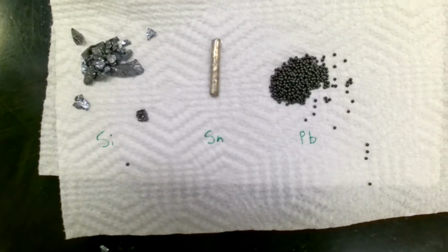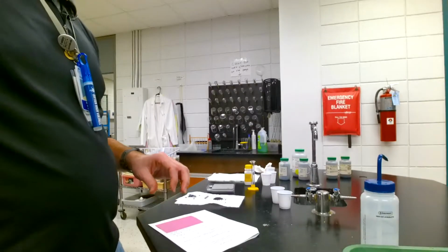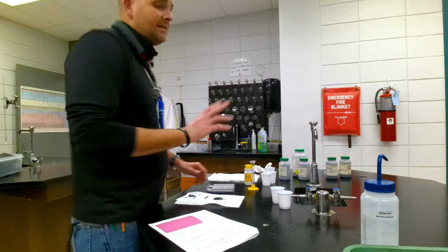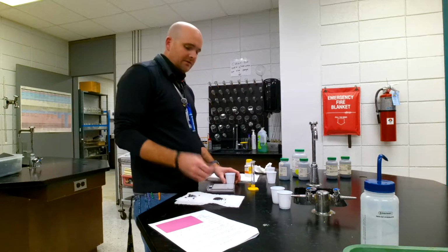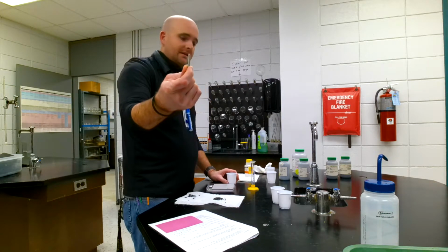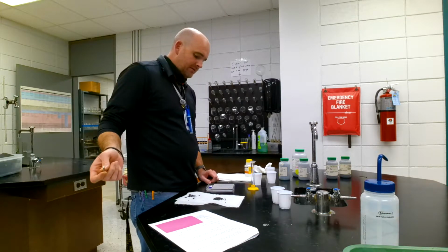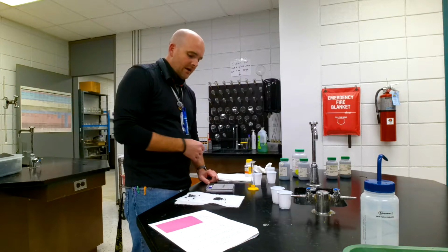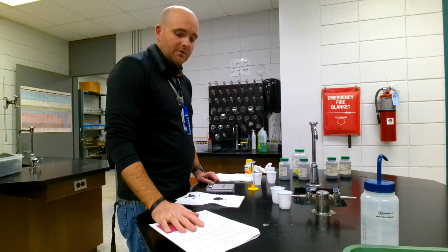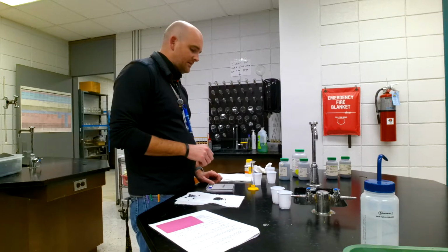Okay, so we have 3 of those metals in our lab here, and so I'll show you them. We have some silicon, we have some tin, we have some lead. So the lab is really a highly technical process of finding the mass and the volume, and it's not that difficult. So simply, let's find the tin one. That's really easy. We will just turn on the balance, and we will place it on the balance. Find the mass here, and your mass for tin is going to be 6.60. I'll let you see my data in just a sec.